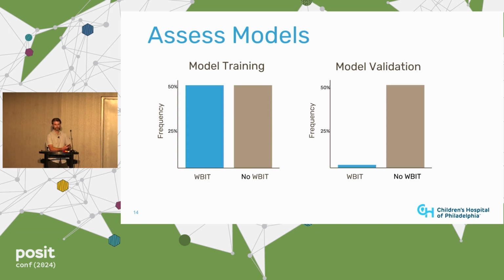The reported prevalence is like 1 in 3,000 to 1 in 5,000 samples. So it's pretty low. What that means for us, practically, is that we have about 11,000 or so samples in the holdout data set, and we downsample them so that only 3 WBITs remain out of 11,000. So the idea is to unleash the models on this unbalanced, downsampled, low prevalence validation data set, and then see how the models perform in terms of PPV.